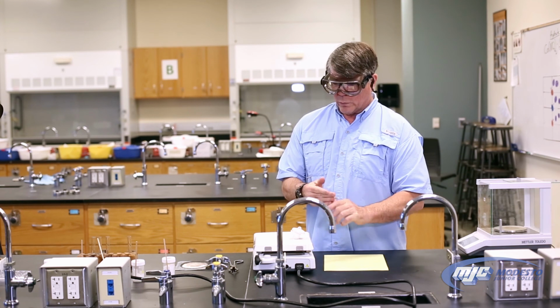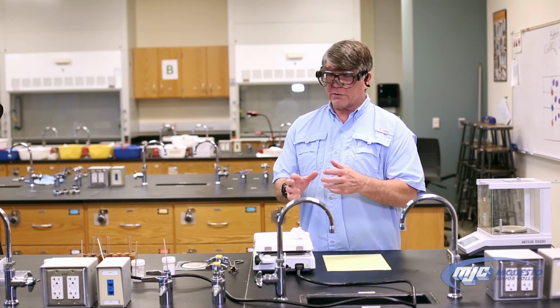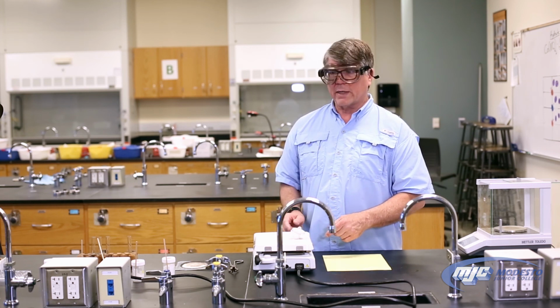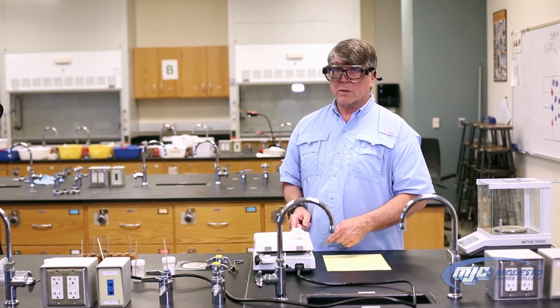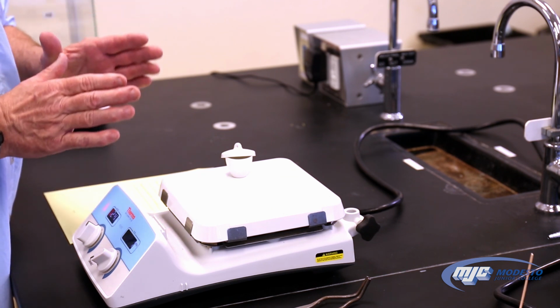So now we're gonna wait for 5 minutes to make sure that all the crackling, if it's gonna happen, has stopped. After that 5 minutes, we're gonna turn it up all the way. We're gonna turn this knob on the hot plate all the way up. We're gonna heat it for 15 more minutes, okay? Then we're gonna take it off and weigh it.